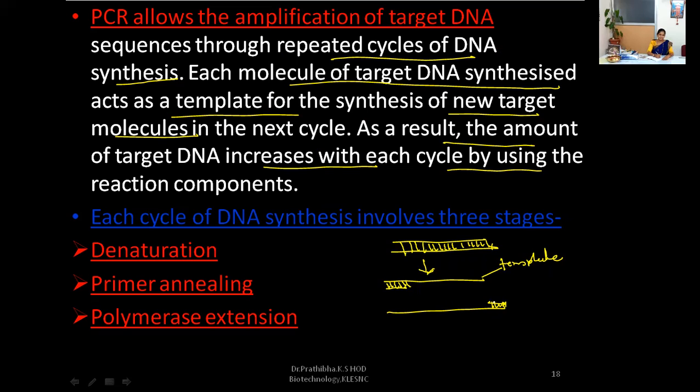Once annealing of the primer is done, the Taq DNA polymerase enzyme goes and binds to the double-stranded initiation region of the DNA molecule. Once it binds to that region, this DNA polymerase enzyme keeps on adding, moving like an earthworm, adding individual nucleotides one at a time according to the template DNA. Here also you can see.